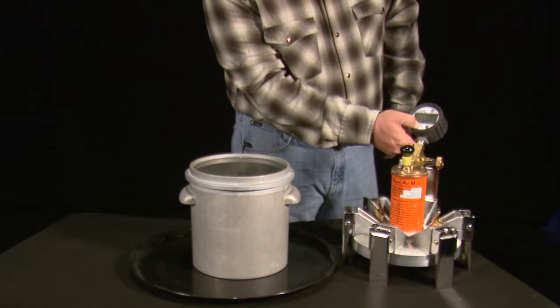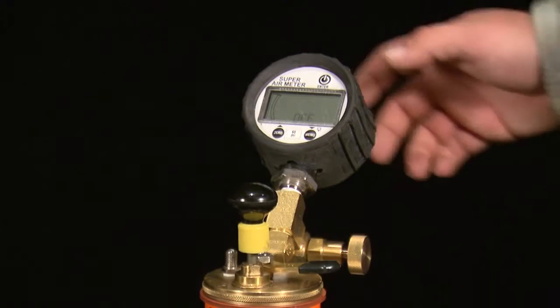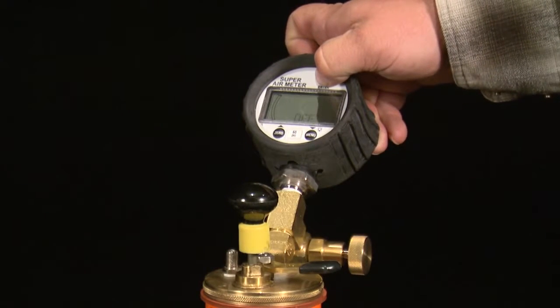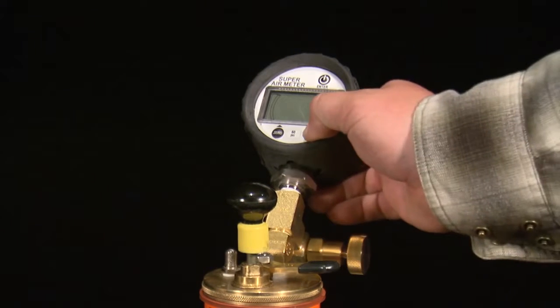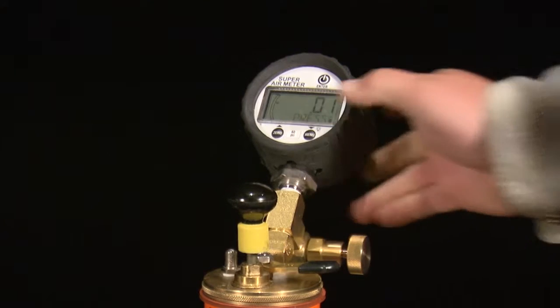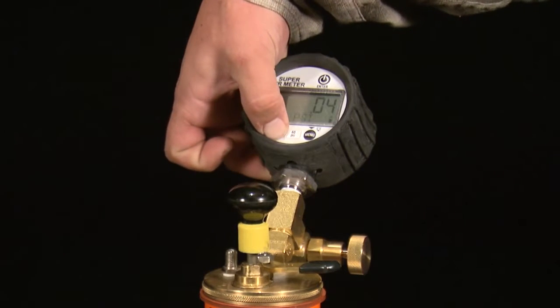To perform the SAM calibration, the first step is to turn on the SAM gauge with a long press of the power button. Zero the gauge by holding the menu button until test mode is aborted and PSI is displayed in the text line of the gauge. Then hold the zero button and the gauge will zero itself.